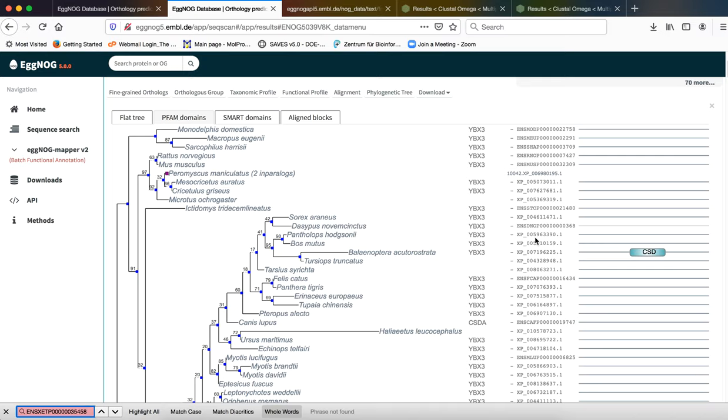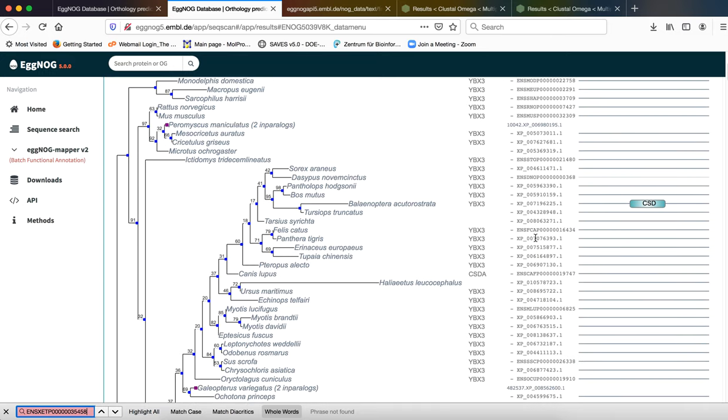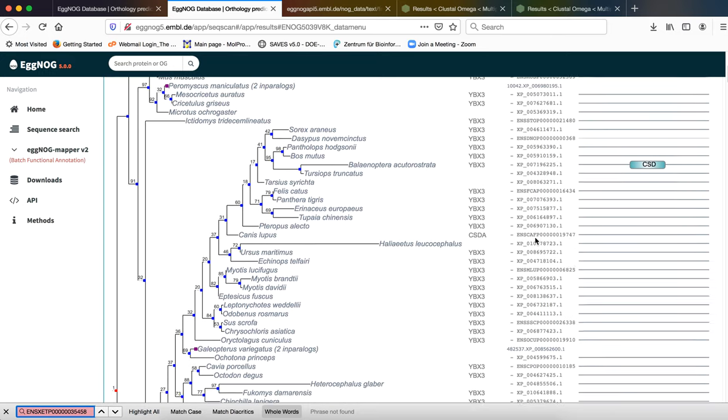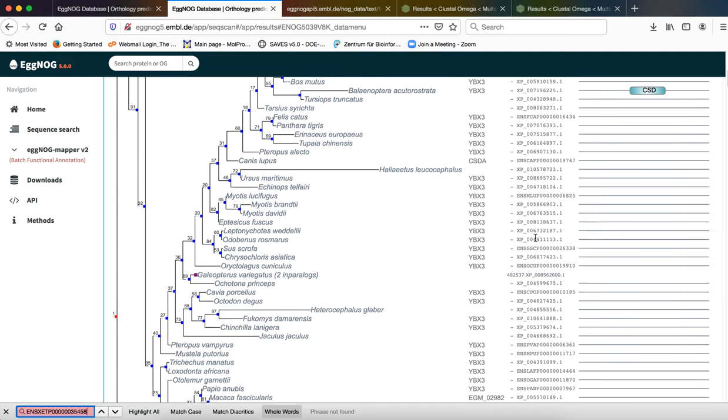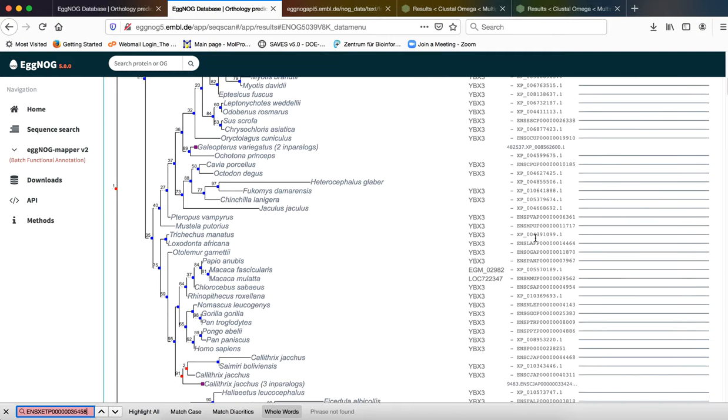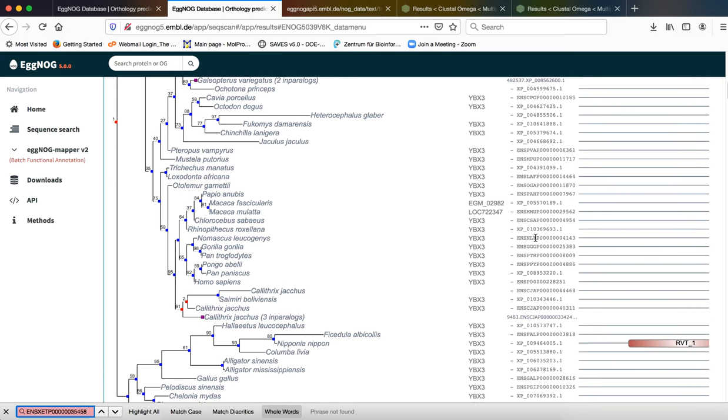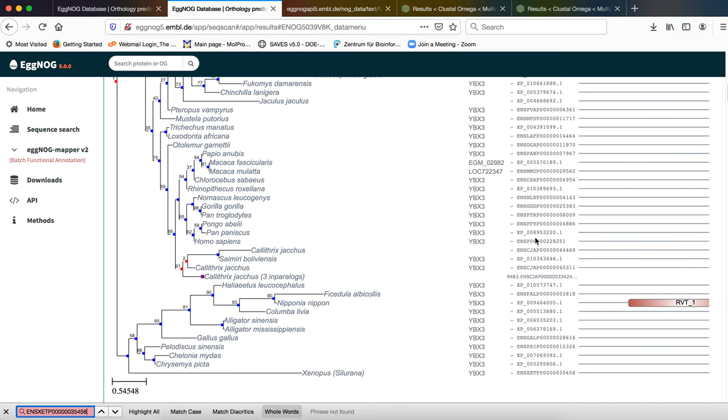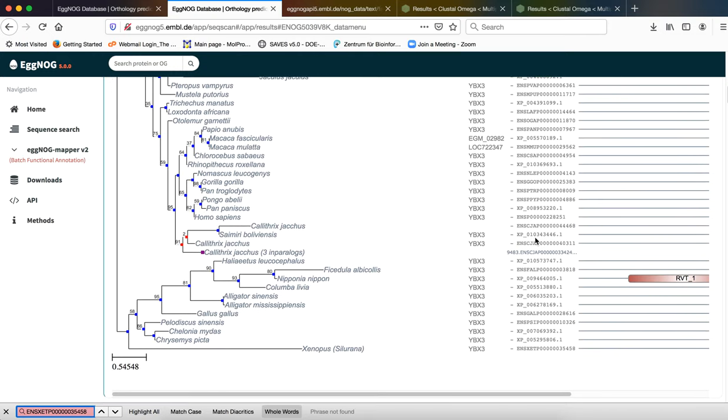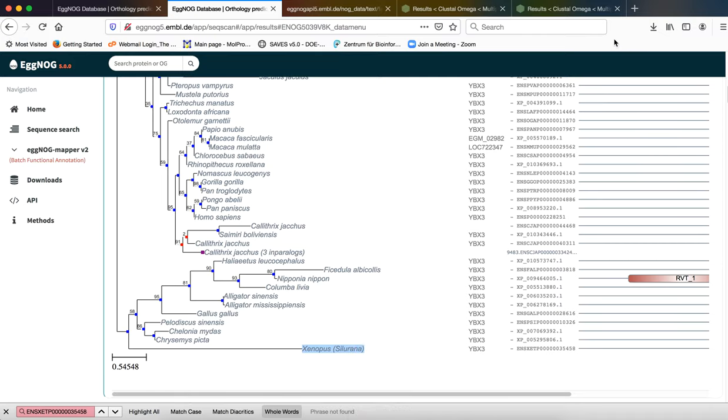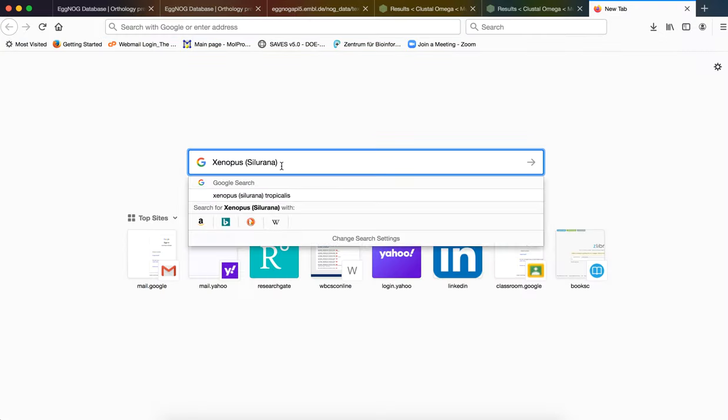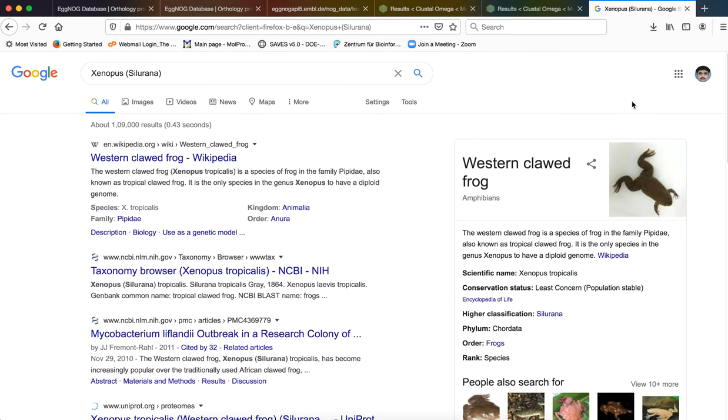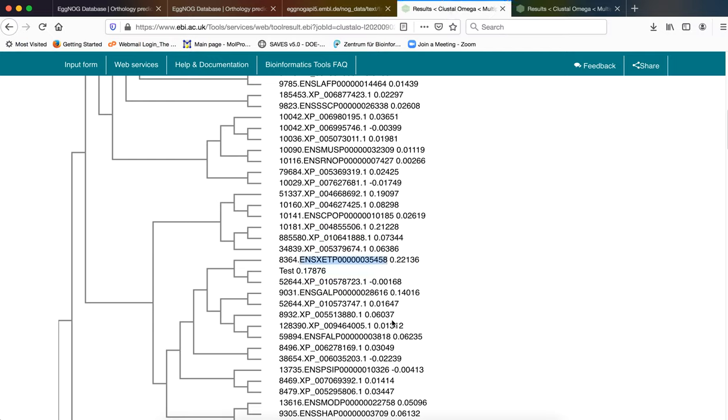Let us now check what that particular sequence belongs to. So this is Xenopus as you can see, this is Xenopus. Obviously we all know that it is a western clawed frog. So as you can understand these are the two most nearest orthologues to our test sequence.